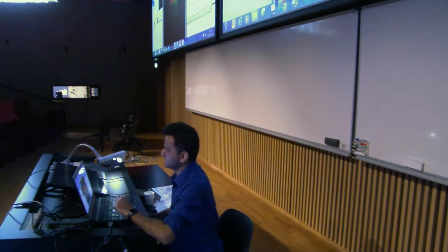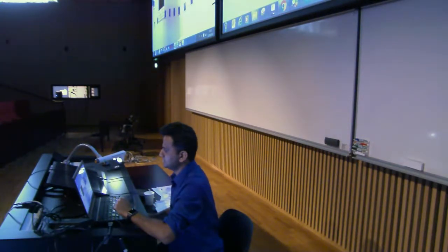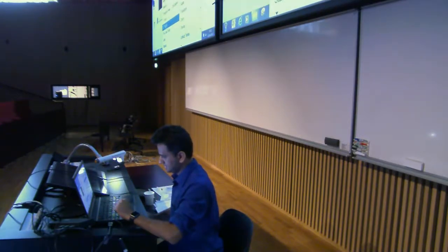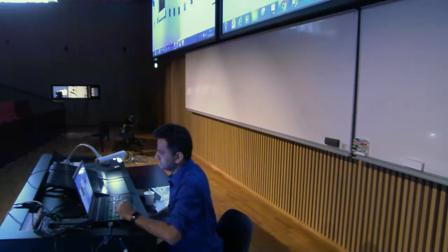Okay, close it. What else can I do? I can just go to image, stacks, set axis, 3D project. I'm not going to go into detail because it will just show me the 3D project.